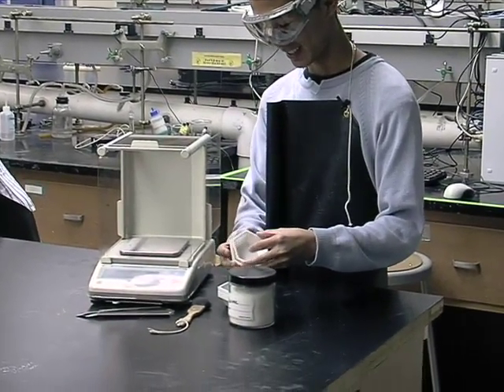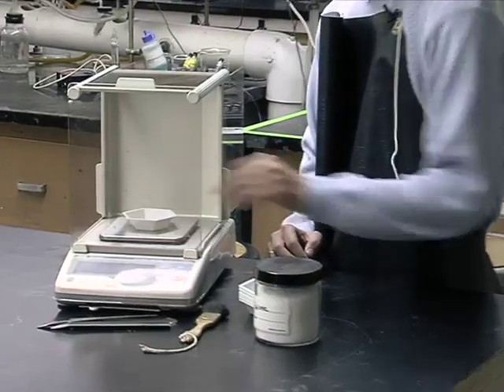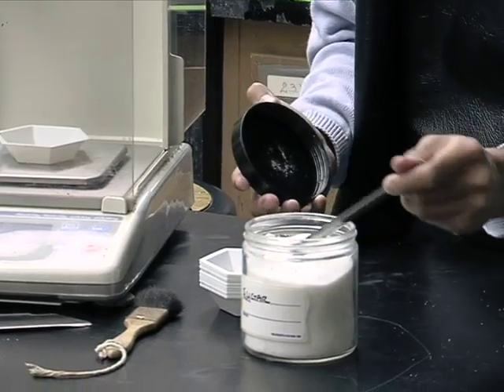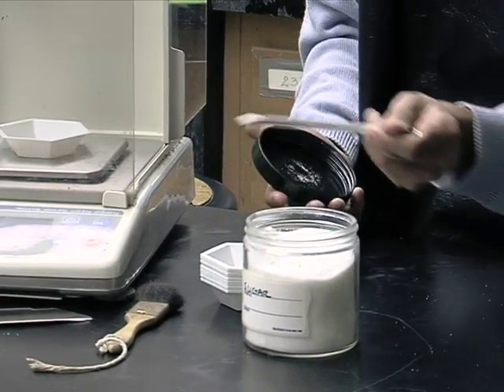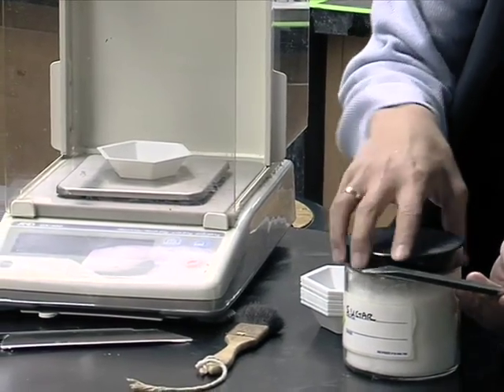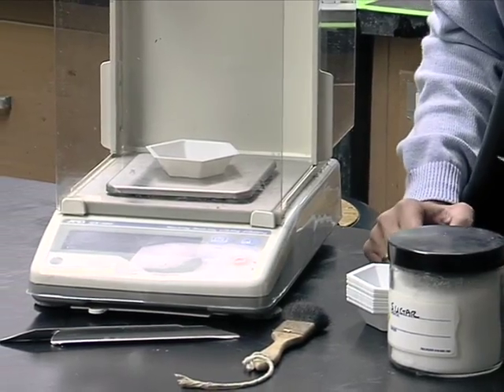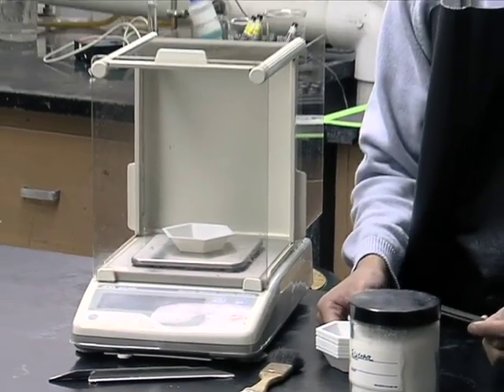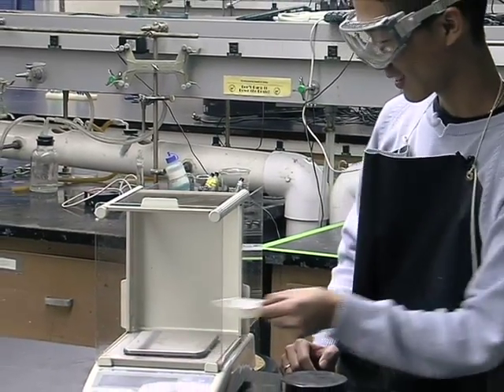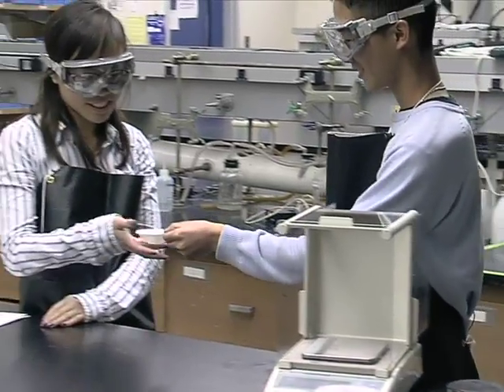I'm gonna get a boat, put it on the tray, get some sugar. It says .498 grams. Marilyn, is that alright? Oh yeah, that's fine. Here you go. Thanks.